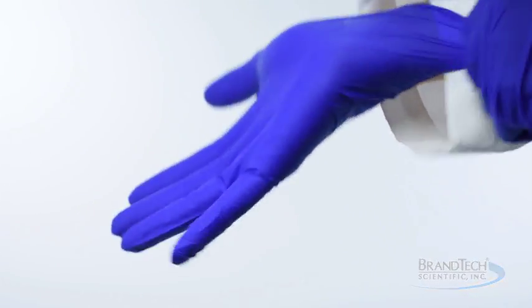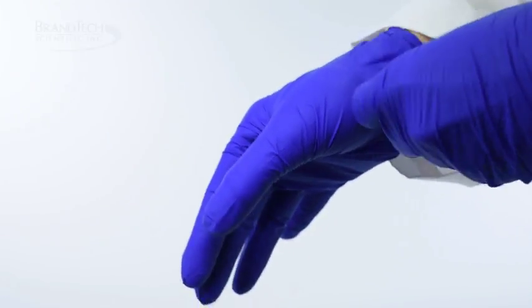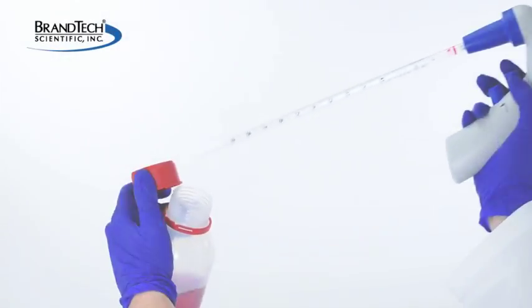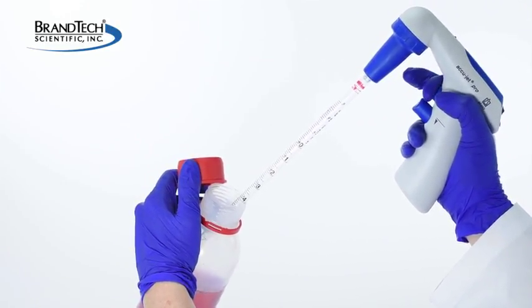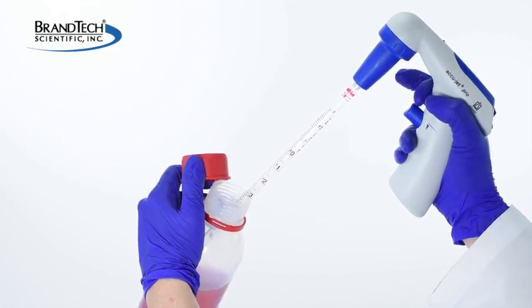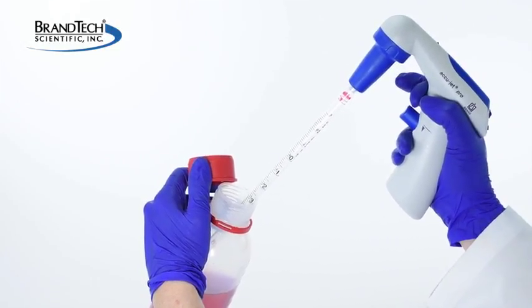Before working with the AccuJet Pro, wear all the appropriate personal protective equipment and observe all safety precautions. The procedure reviewed in this video can be used if your AccuJet Pro is not charging properly, not holding a charge, or is experiencing an electrical error.